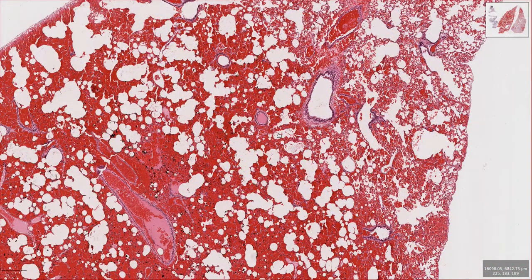You might say that was easy because in all the bronchi and bronchioles there were no red blood cells really, whereas the arteries and veins were packed full of them.